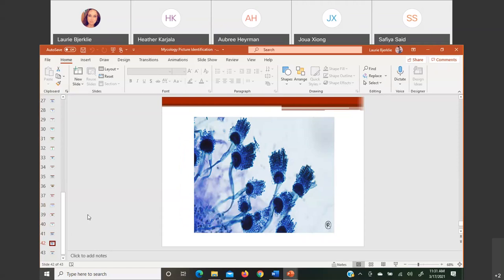I was waiting to see which one people go with. I thought for a second, oh, they're going to say penicillium, because it definitely looks like penicillium, because it kind of got a little wild looking. It is supposed to be aspergillus. It's a little bit bigger than penicillium, but yeah, I definitely almost thought that's the same thing. So I got why you guys said that for sure.